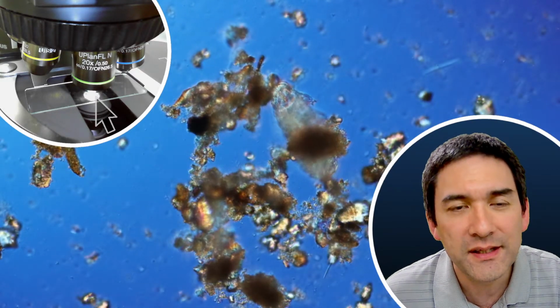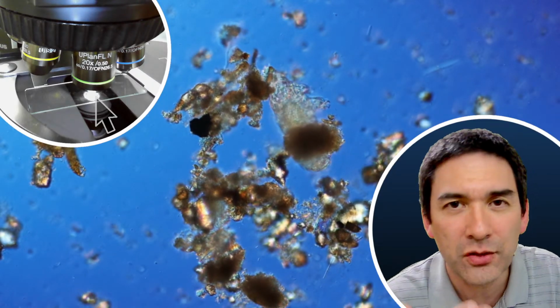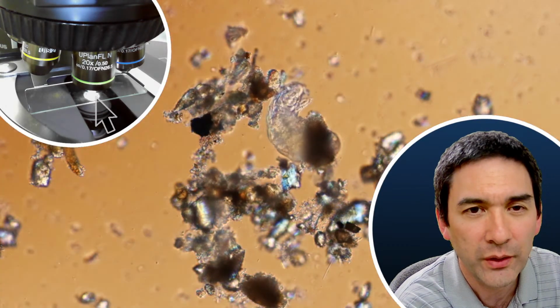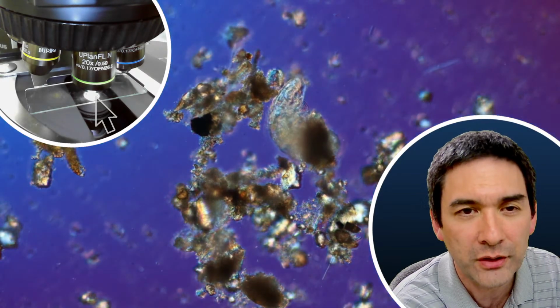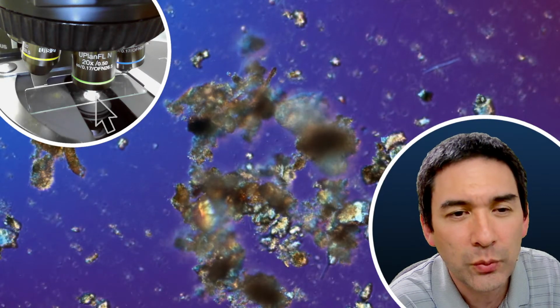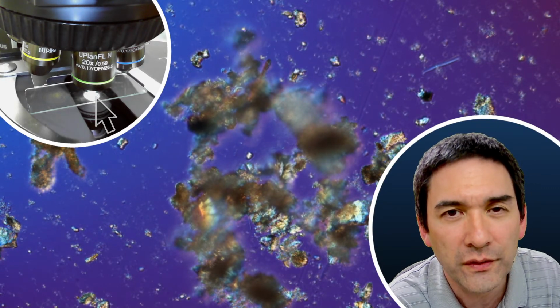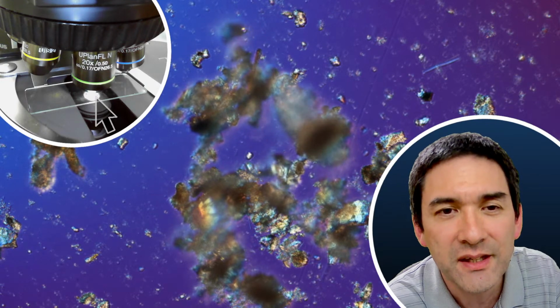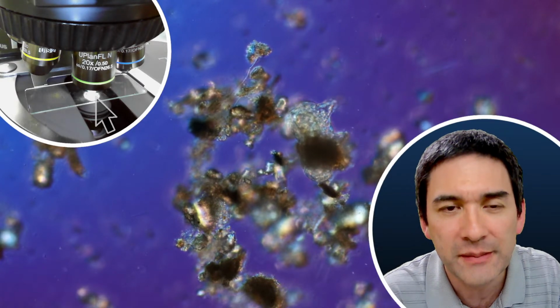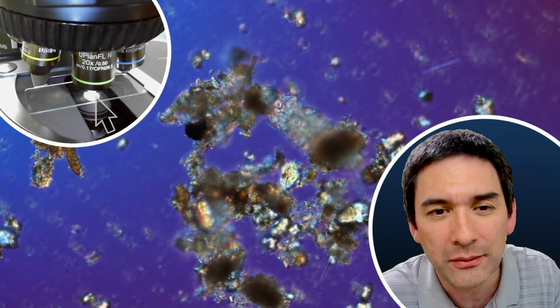DIC can imitate Rheinberg in the sense that the background has a different color than the specimen. And if I rotate or shift a prism, you can see that I can even change the background color. But actually, the technique is very different. Essentially, because of differences in refractive index, DIC gives some objects the appearance as if they are three-dimensional, as if a shadow is being cast. However, this does not resemble the actual 3D appearance of the object.